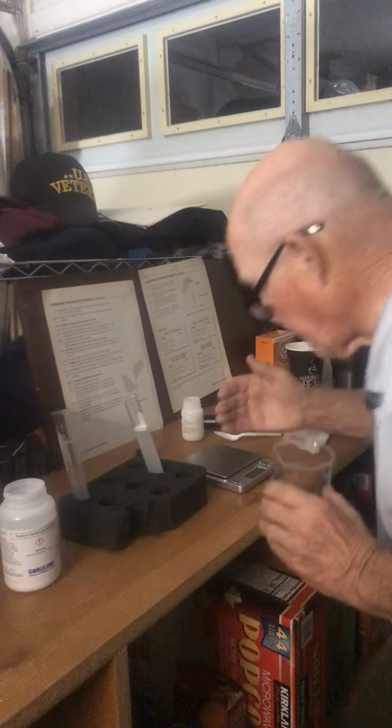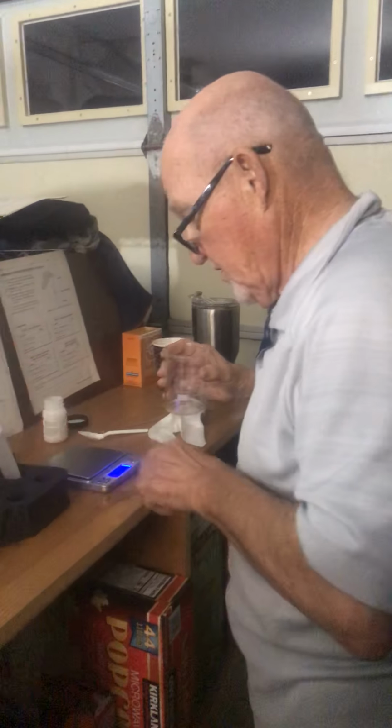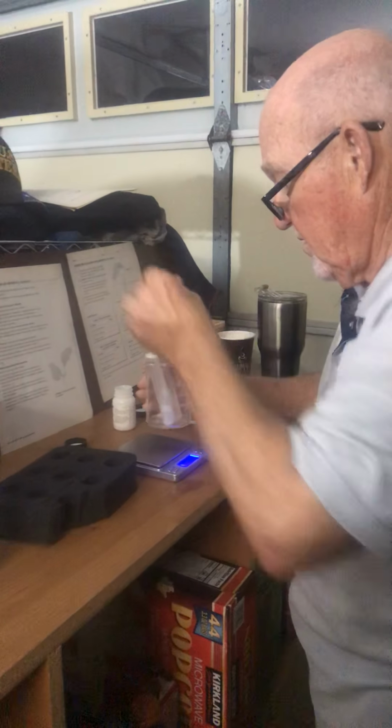So what we're going to do is now measure using our handy dandy scale here. We're going to measure it in grams. 1 gram is about the size of a paper clip. So now it's on 0. We're not going to mix it up yet. We're going to put them both in here and find out what the mass is.